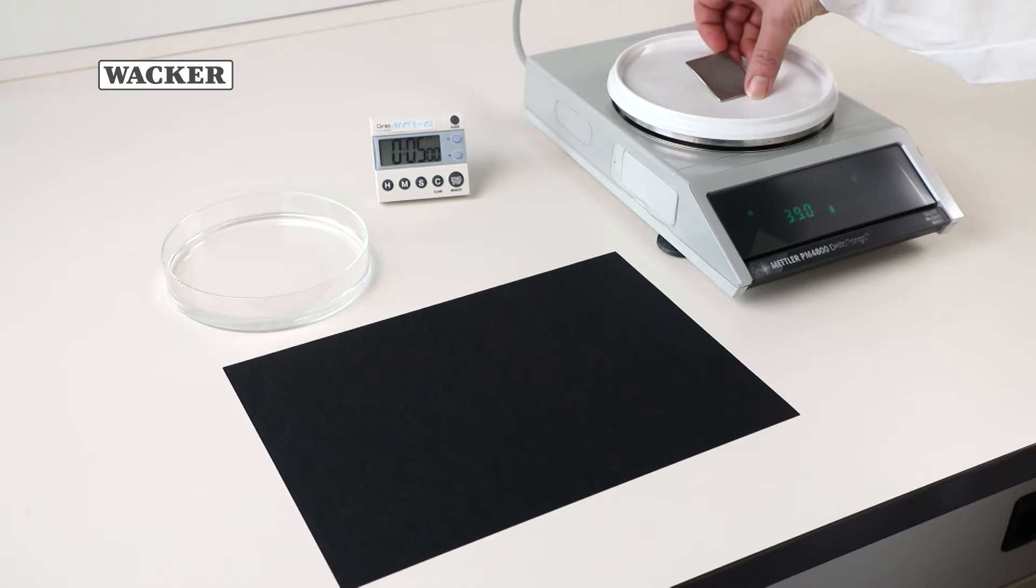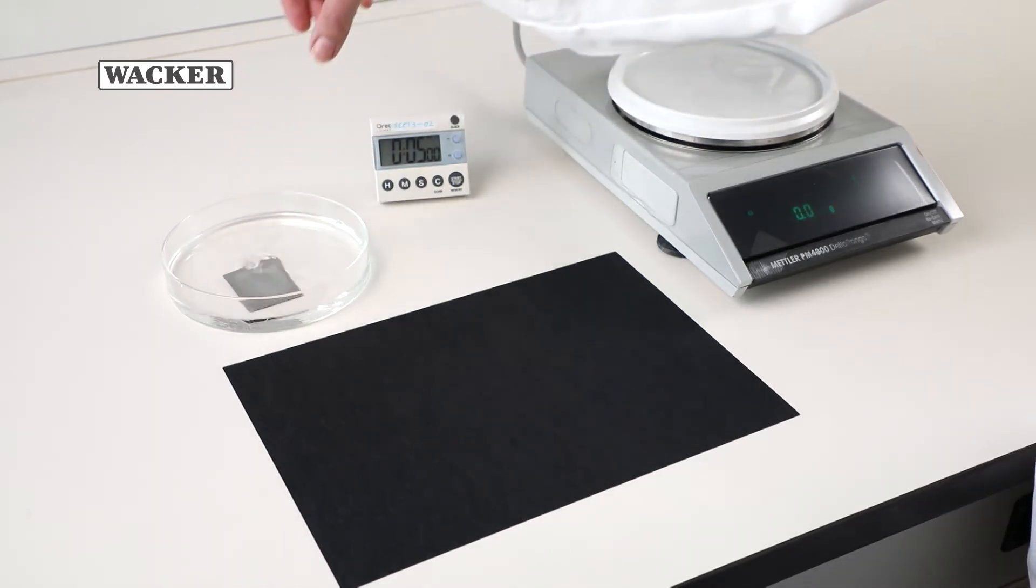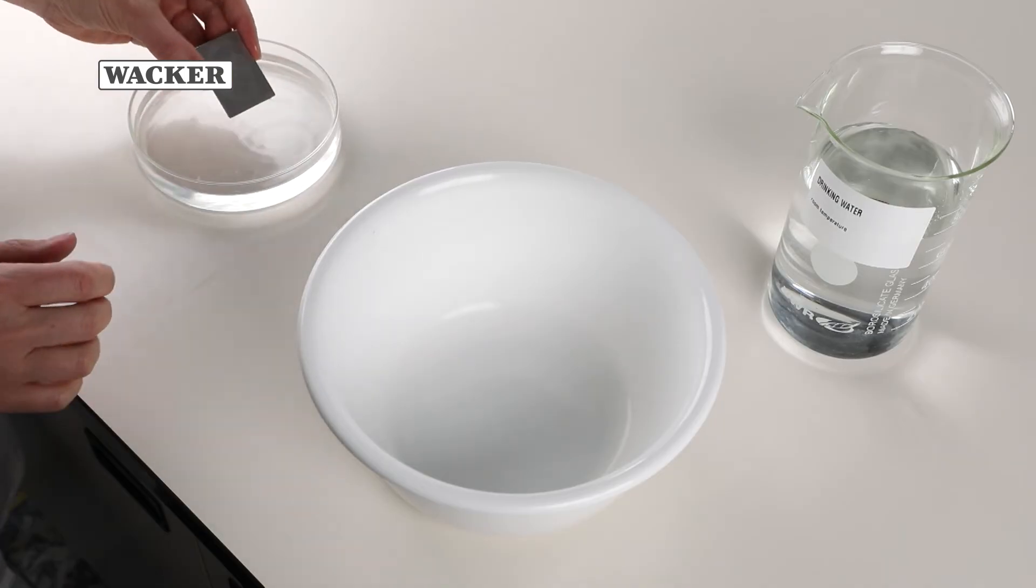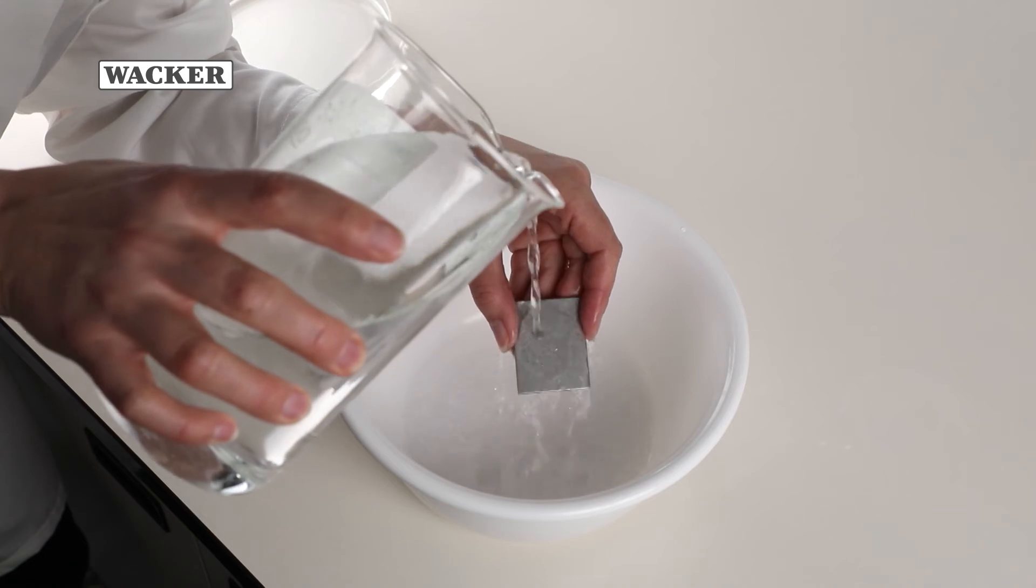Next, place the plate in room temperature tap water and allow to stand for 5 minutes. Once this time has elapsed, remove the plate and rinse with 1 liter of tap water from a height of approximately 5 cm.